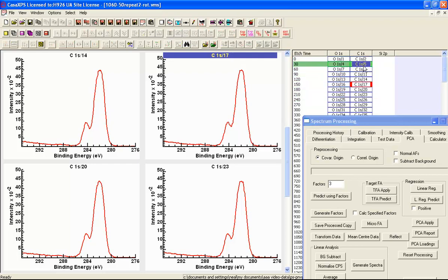So if I select these two and overlay these, you can see that in the active tile I've now got two spectra that look reasonably like the spectra that I would expect to see for these two polymers. I've looked at the Beamson-Briggs polymer database, and I can see that these are very similar to the data envelopes that appear for what they call PNVP and PS. So I'm going to make use of these to analyze this data set of carbon 1s that are evolving between the different layers and the interfaces between the different layers of this depth profile.